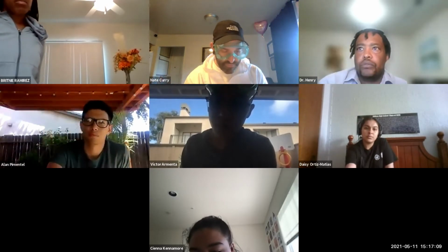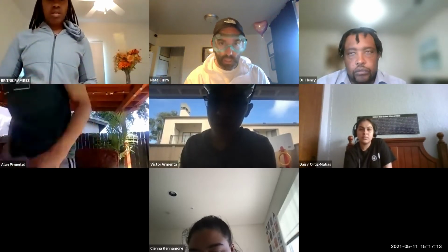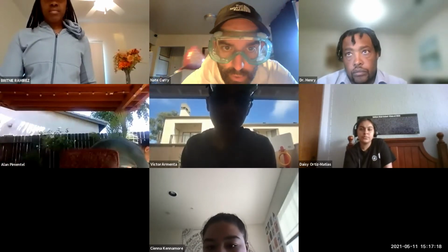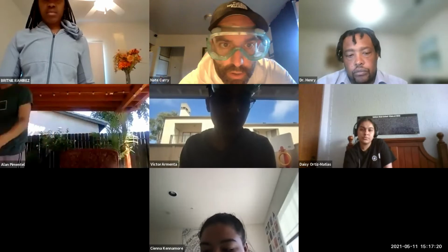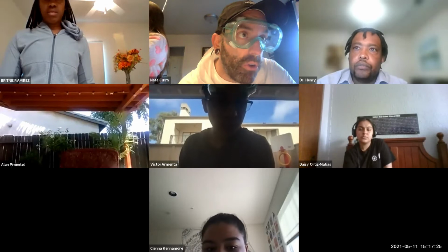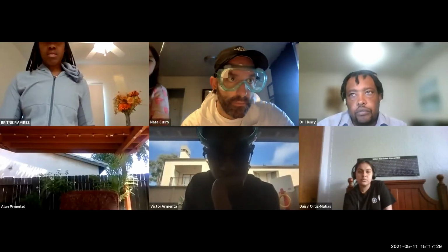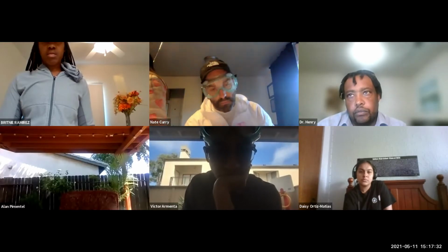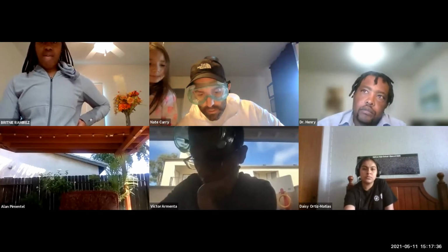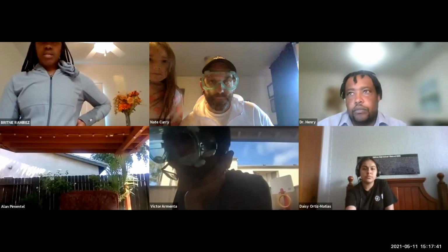Citric acid is listed first. That means it must have the highest amount. Okay. It doesn't give me a percentage here. Ingredients present in the greatest amount are listed first. What percent of the drink mix is citric acid? I don't know. Do you guys' packages say how much citric acid percentage it is? No.